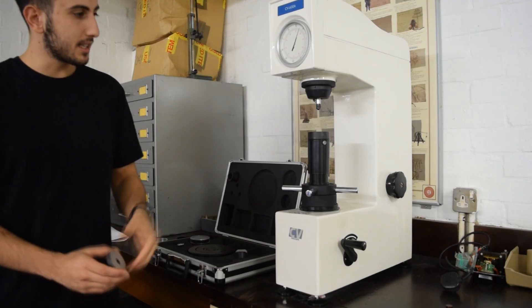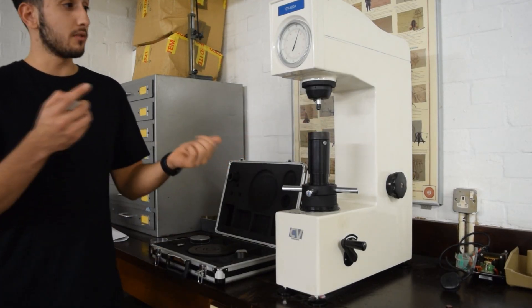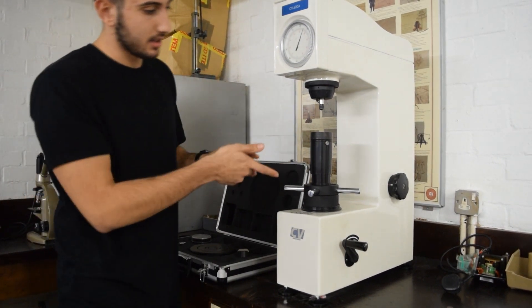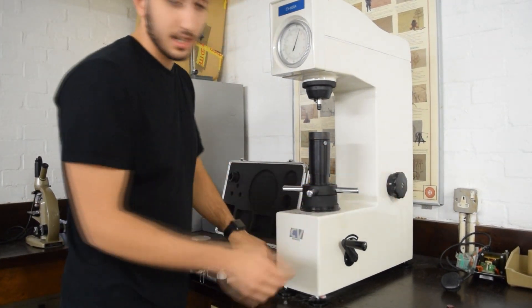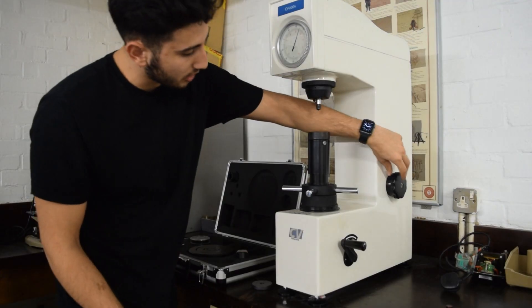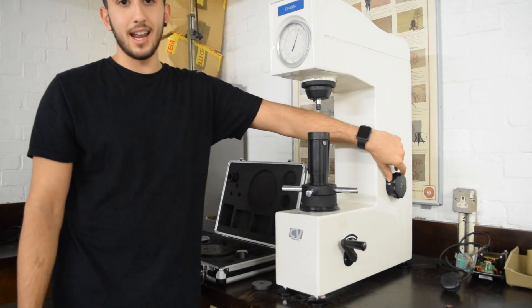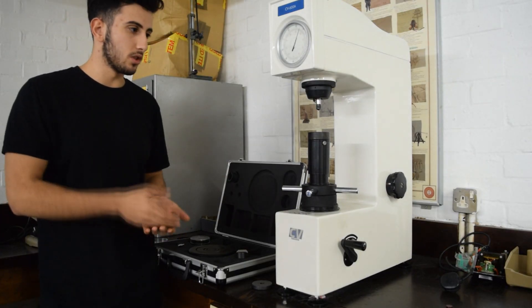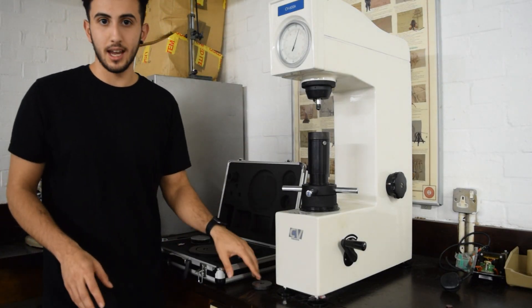With a B scale indenter, you first have to apply a minor load and then a major load. The major load has preset settings on the side of this machine and we just make sure that it is reading 980. You have a specification sheet that shows you the loading — the minor and major loadings of different scales.